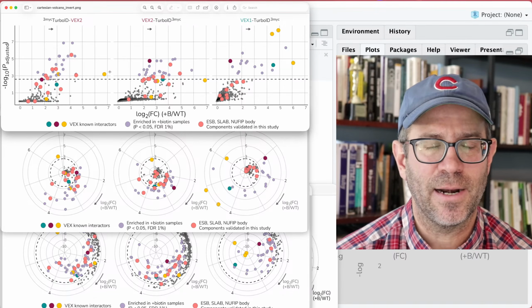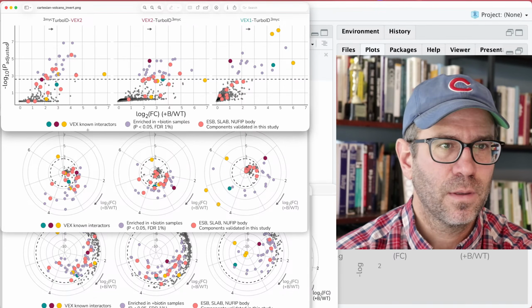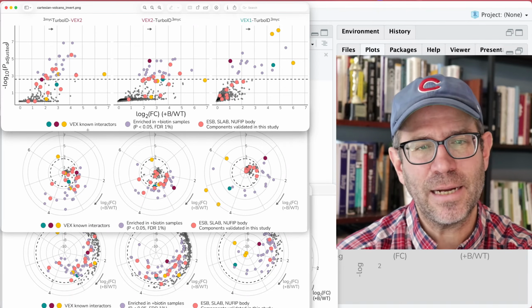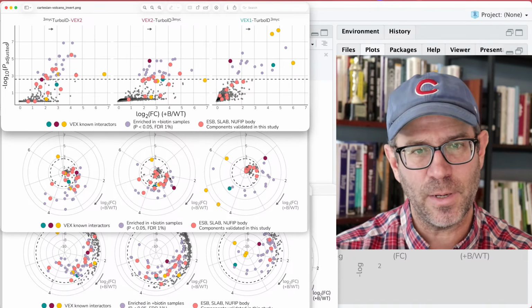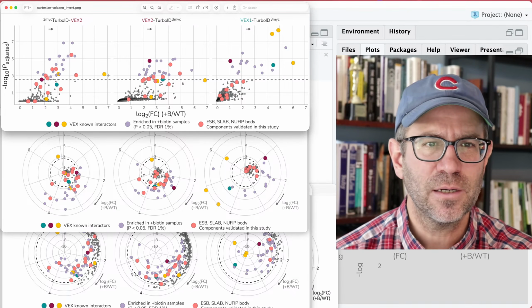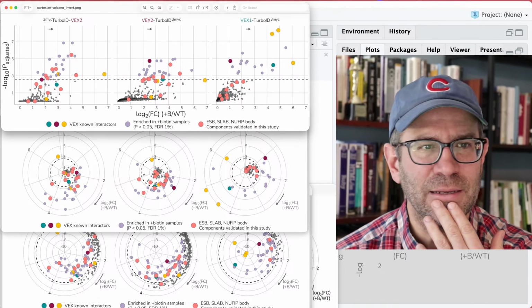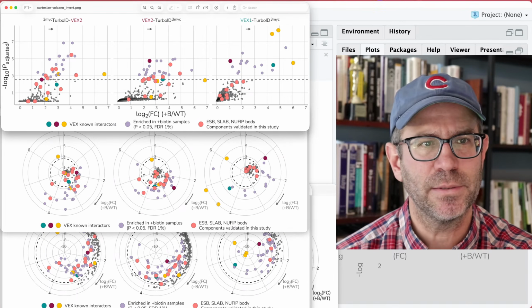I see I still have that arrow there that I need to get rid of, but whatever. You know, I can kind of see in my radial format where things are spinning outwards, where you might get more separation of the data than you do here. But, you know, this also gives a lot of highlight to the non-significant points.